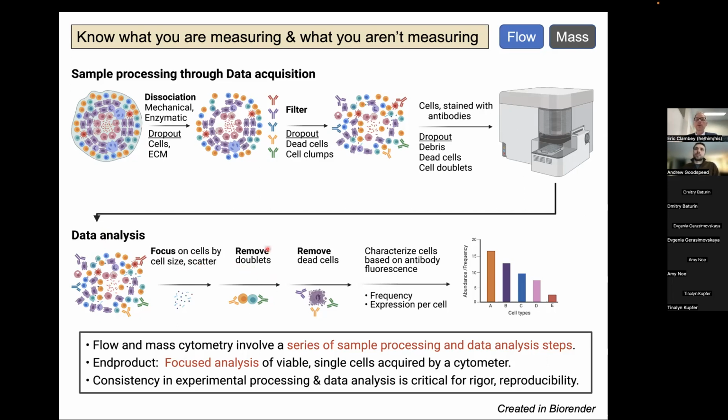But you also remove doublets, because since cytometry is a single cell focused technology, doublets have the possibility of confounding your results. You don't want to, for example, be very excited about an interesting cell phenotype, which is essentially just this orange cell and this green cell, which happen to be stuck together. You also remove dead cells in the analysis, and ultimately you obtain single cell data quantifying protein expression, which can then be aggregated into different cell types. But the point of this is that when you use these technologies, it is important to be aware of both the strengths and the limitations of them.